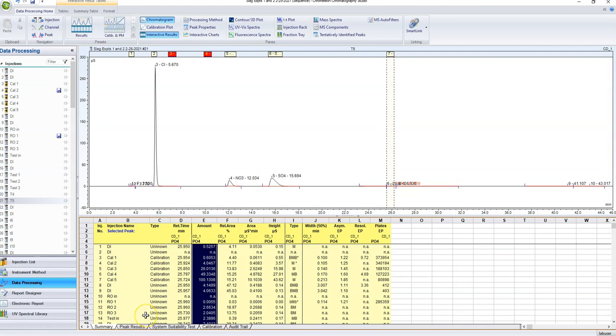So don't play around in somebody else's files, because you could mess up their processing method. Play around in your own, and ideally with your own processing method, something that you made yourself. But I'll talk about some of the most useful tools right now.